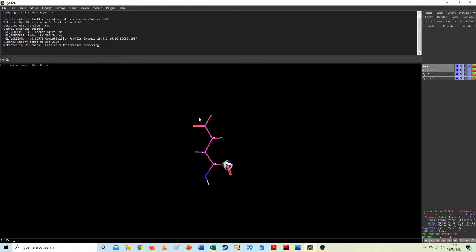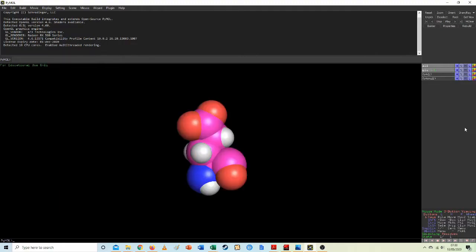Now I want to see if I can show this slightly differently. Oh, okay.